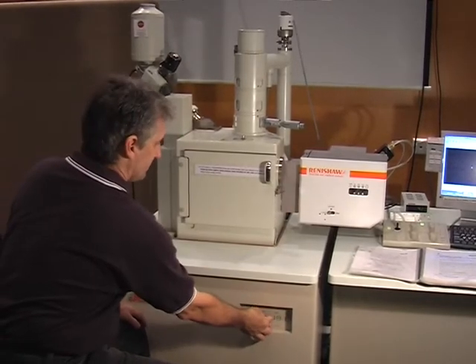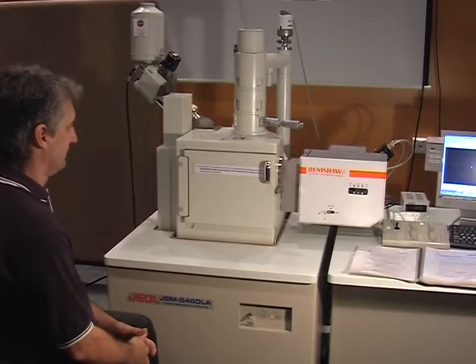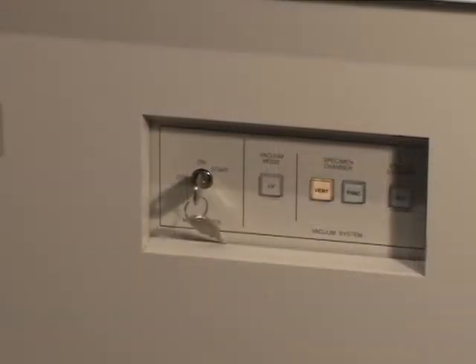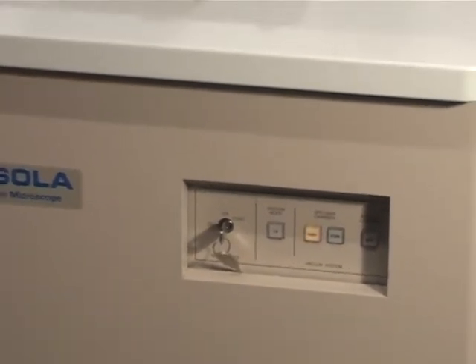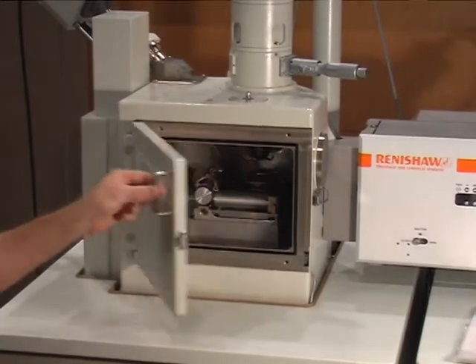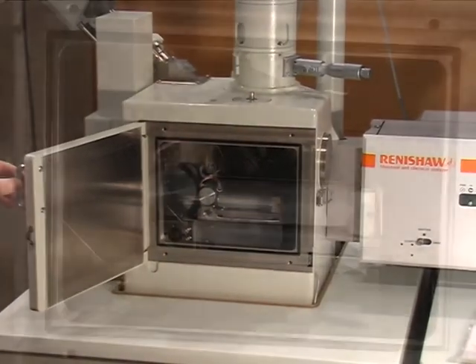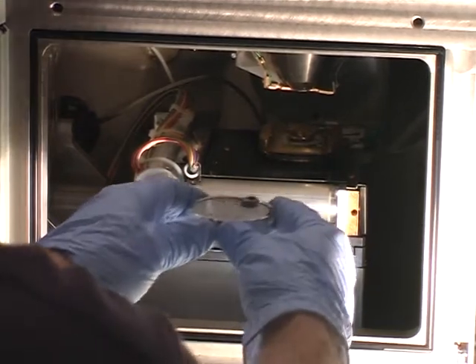Vent the chamber — this takes a few minutes. To insert a sample, check carefully that your sample will clear the pole piece and detectors.